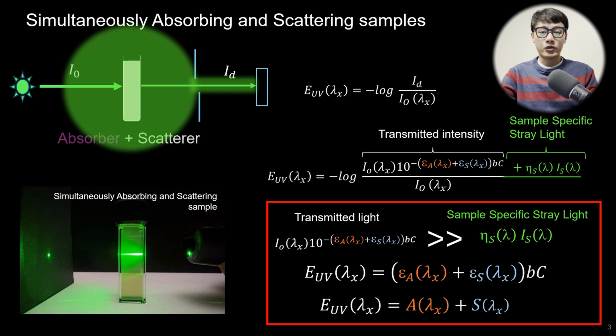And at low concentration, where the scattered photon interference is minimal, the extinction measurement may still appear linear. Keep that in mind. The extinction measured here is actually a combination of both the absorption and the scattering extinction of the sample. Thus, as the concentration increases, the detected signal becomes more and more contaminated by the scattered light, leading to deviation from the Beer-Lambert law.